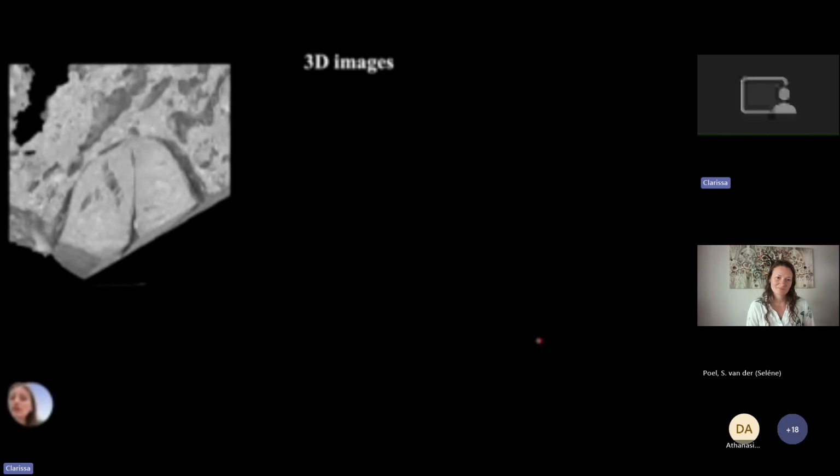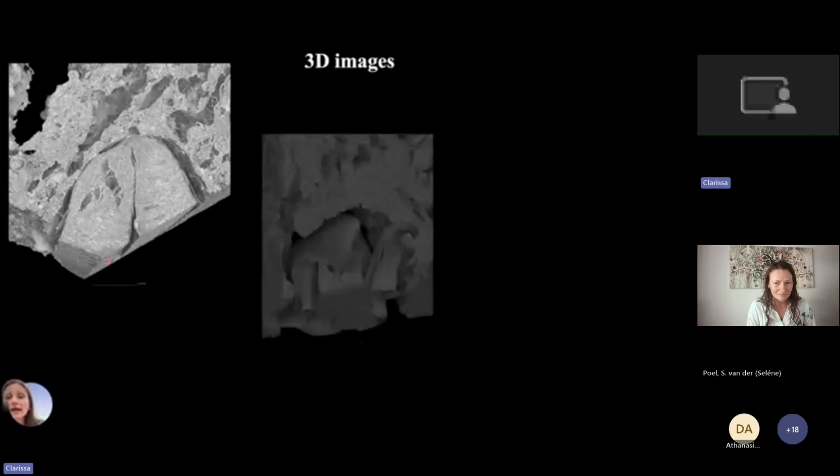So some of the things that I've been able to do with the data, for example, is do 3D reconstructions of some of the tamales. And here you have one on the left that is basically the matrix, the maize-based tamale. With here you have a squash seed and it's cut, but these are the kind of things and the resolution that you can get.